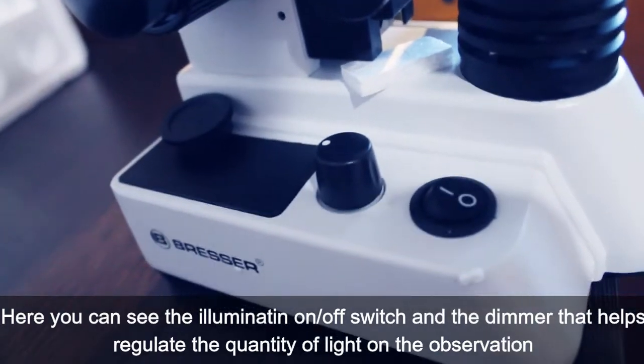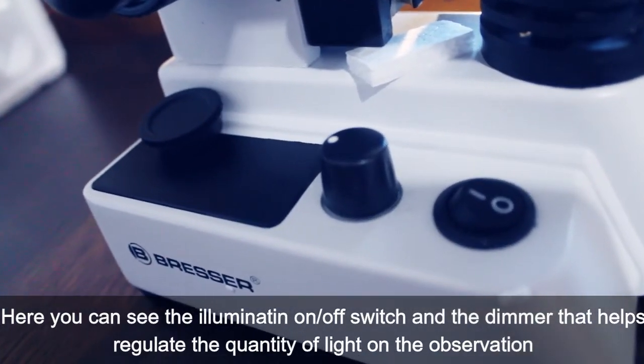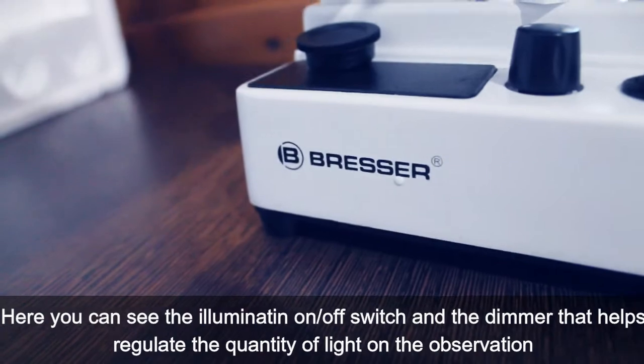Here you can see the illumination on/off switch and the dimmer that helps regulate the quantity of light during observation.